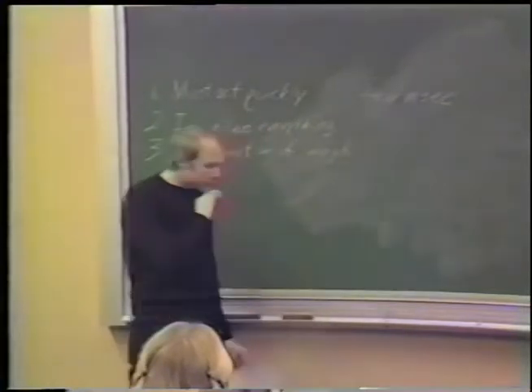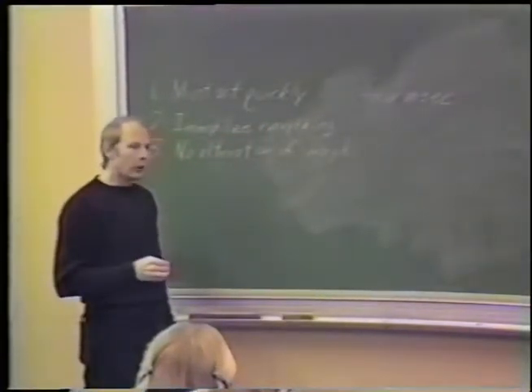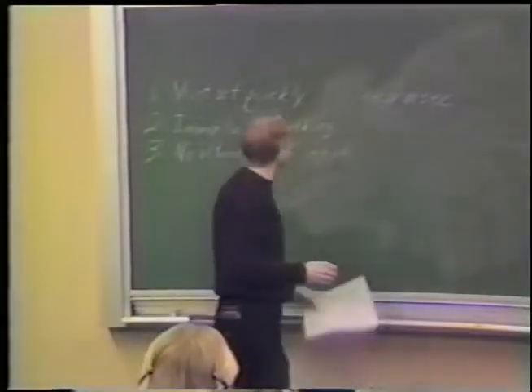Now, one exception is high-pressure freezing, in which the freezing can go on for a longer time. That's how you get the greater depth in high-pressure freezing. You're suppressing ice crystal growth and nucleation. So you won't have quite the time resolution, but you can do thicker samples. There's a trade-off. There's always a trade-off somewhere.